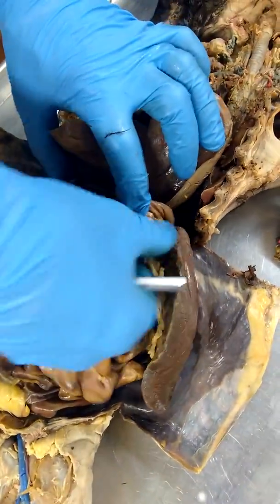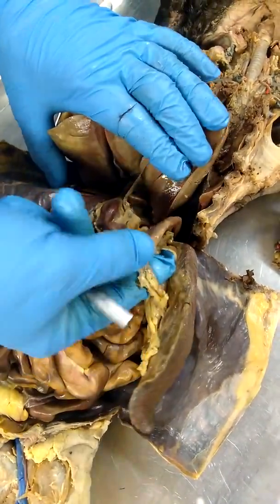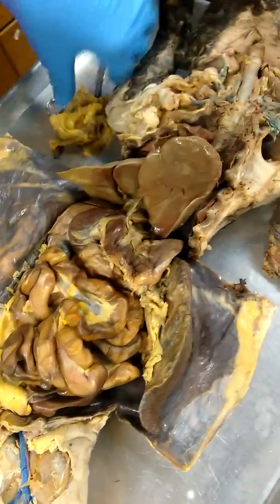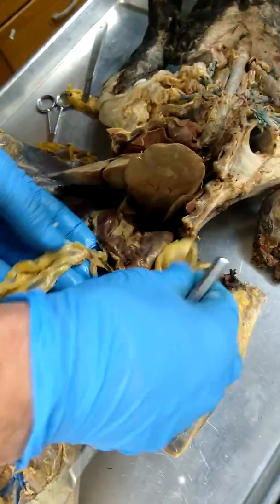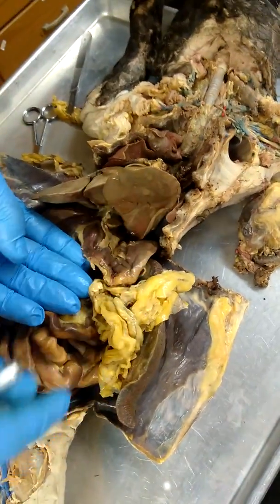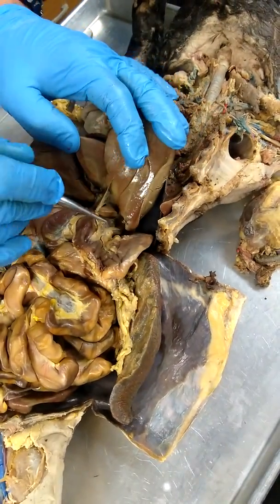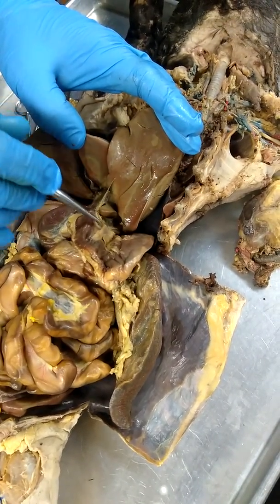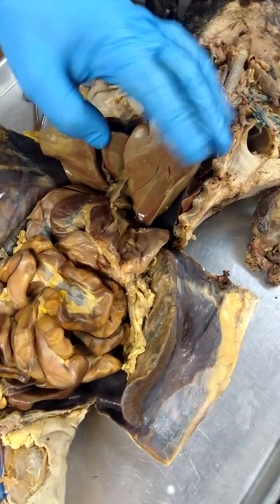Yours has been cut off, but there should be a big apron of fat coming off there called the greater omentum. That might be this. Yes, this is it right here. So this. Put that back together. Yeah. So that's your greater omentum. On the inside, lesser curvature here, this little strip that goes over to the liver is called the lesser omentum.